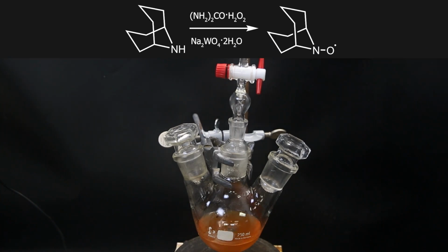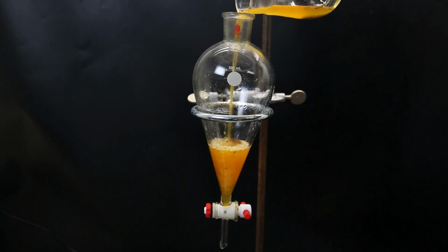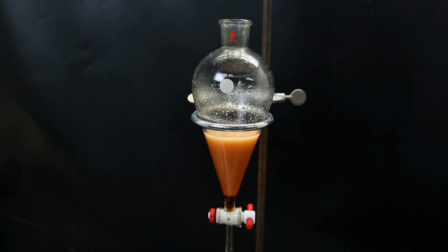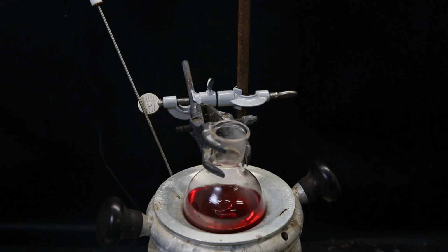In the reaction, the sodium tungstate will catalyze the reaction between the amine and the hydrogen peroxide, causing the formation of the nitroxyl radical. When that is done, I move it all to a separatory funnel and extract it 3 times with 50 ml of DCM. We can see the red product moving into the DCM layer. Now I have combined all of the DCM extracts and we are left with a red solution.